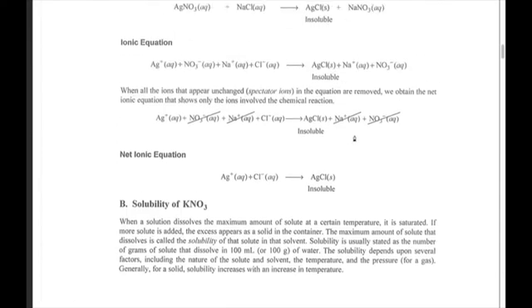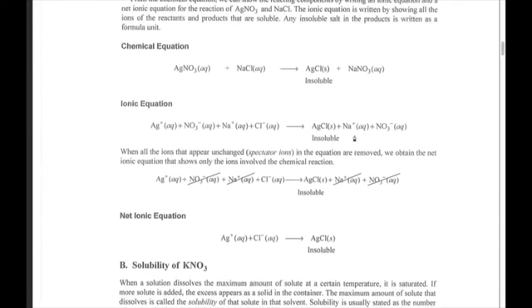If you go back to your pre-lab, you can see here they actually give you the answer to that first problem. They show you how you write out the products of your double replacement reaction. Again, they point out that silver chloride is a solid. Notice that everything else has the state symbol aqueous, because they are soluble in water. It's the silver chloride that is not, that forms that white precipitate.